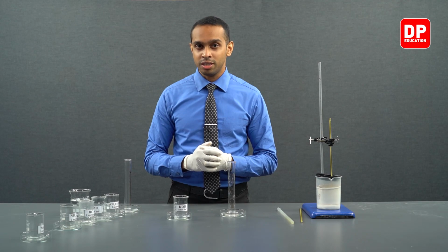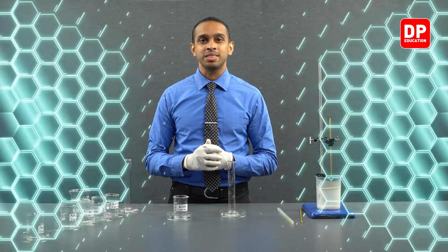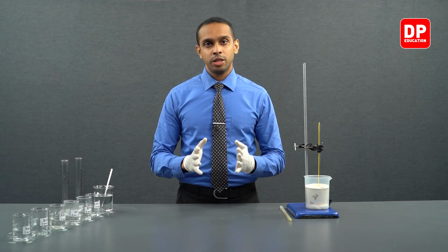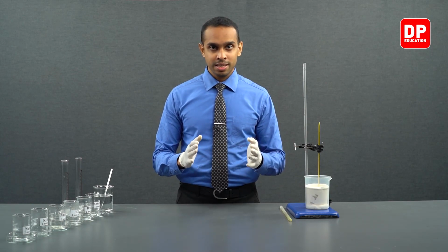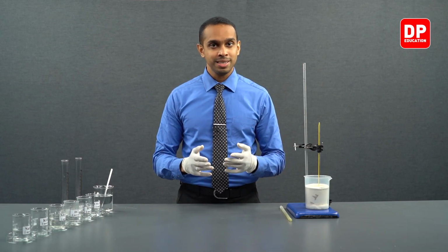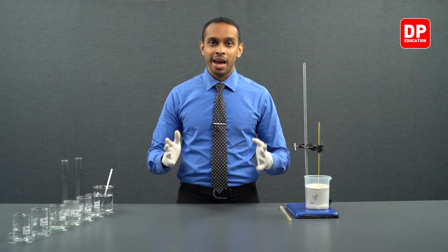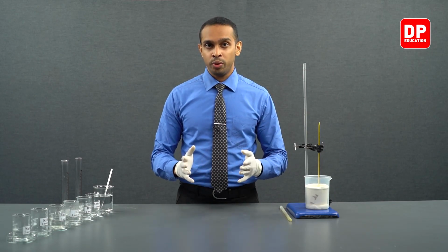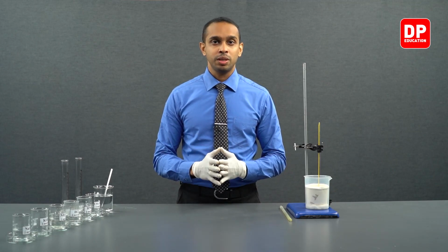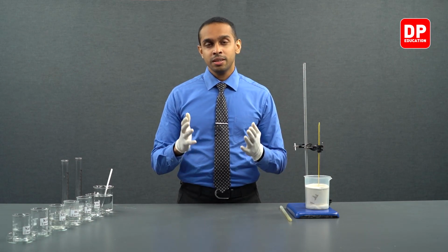Now, after recording these temperature measurements, we can move on to the third part of this experiment. In the third part of our experiment, we are going to see an acid-base reaction between a strong base and a weak acid. We are going to use sodium hydroxide as our strong base, and we will be using ethanoic acid, commonly known as acetic acid, as our weak acid.